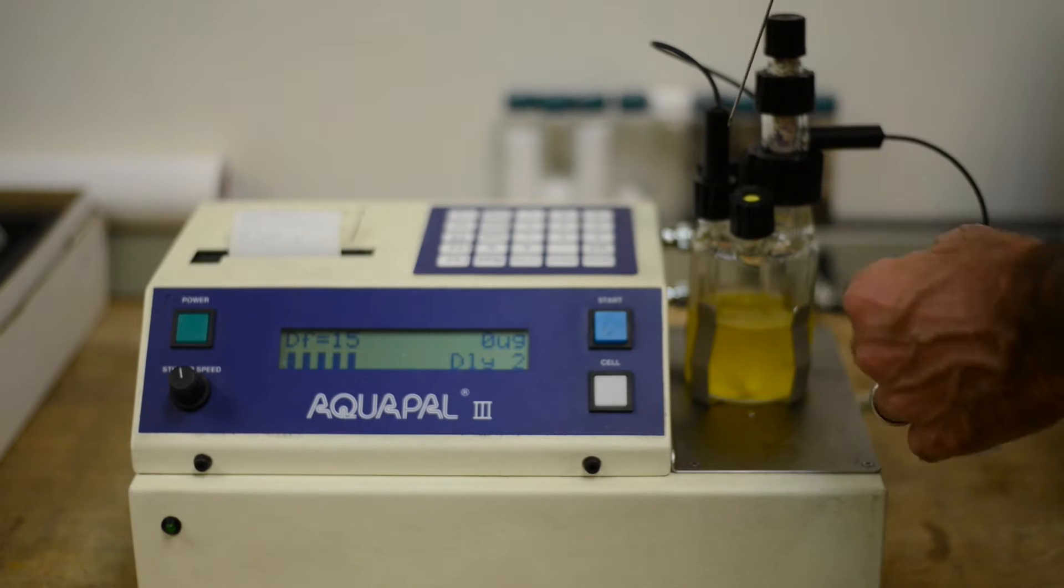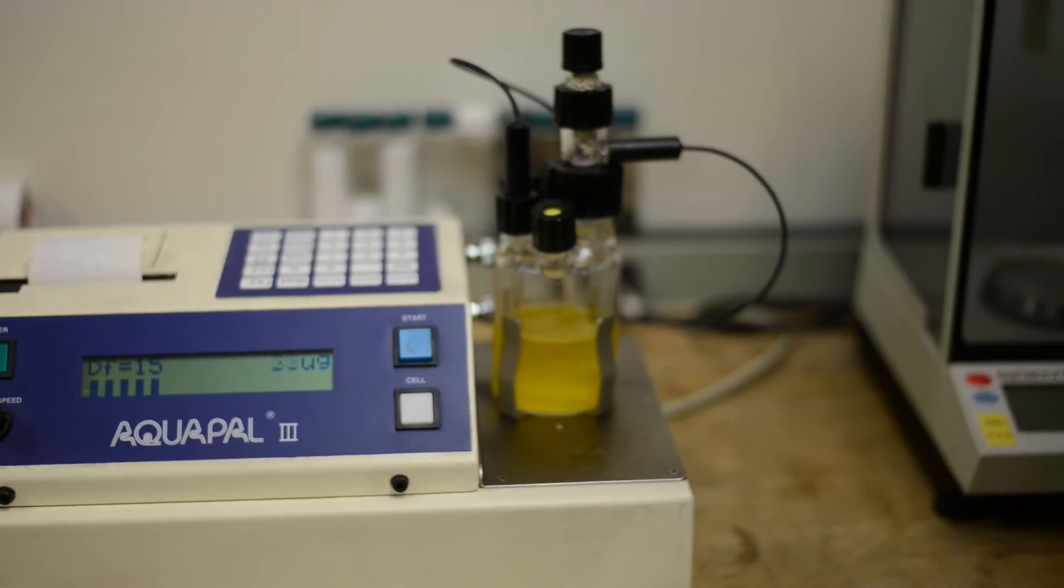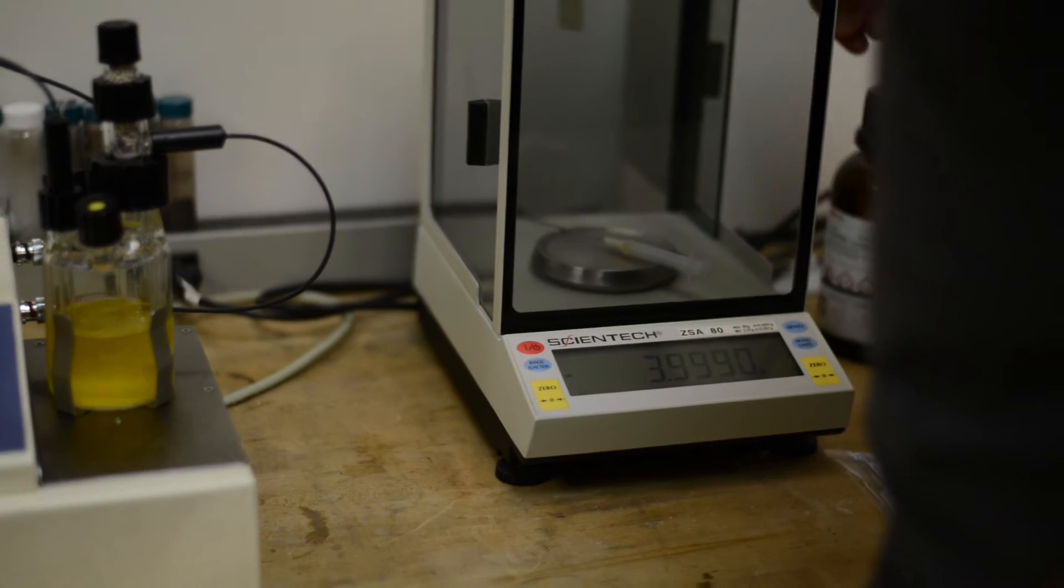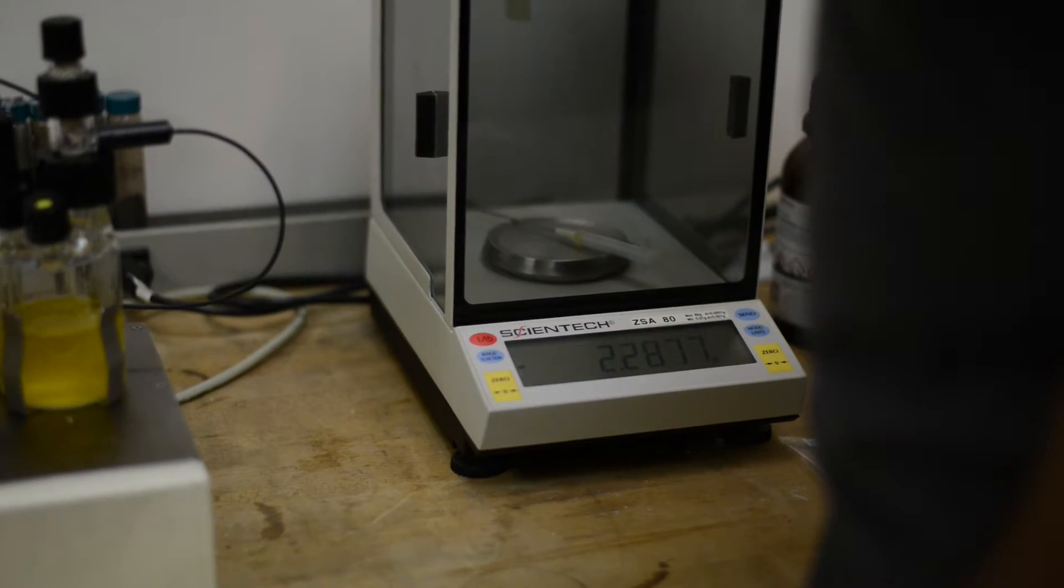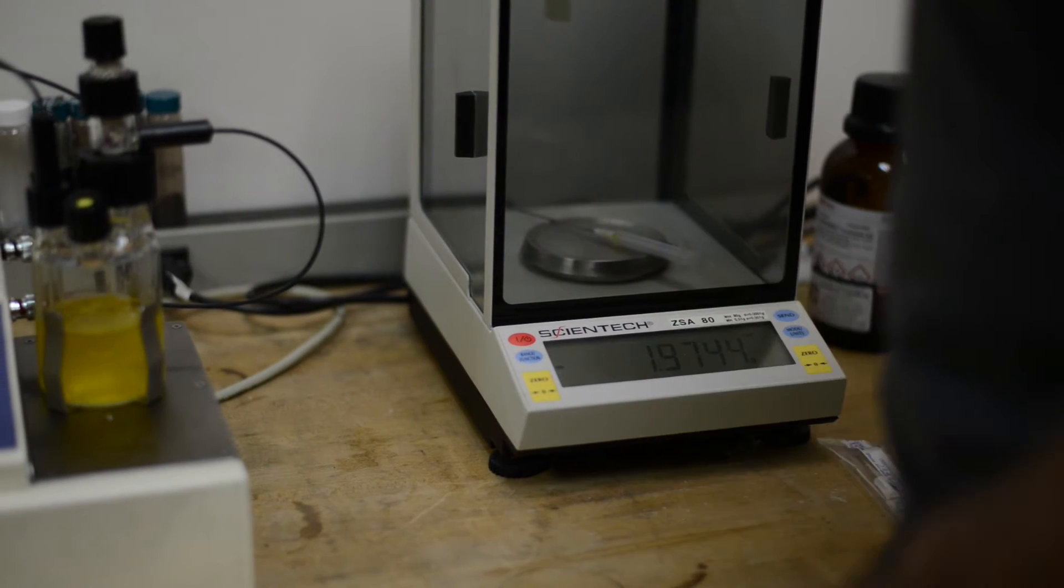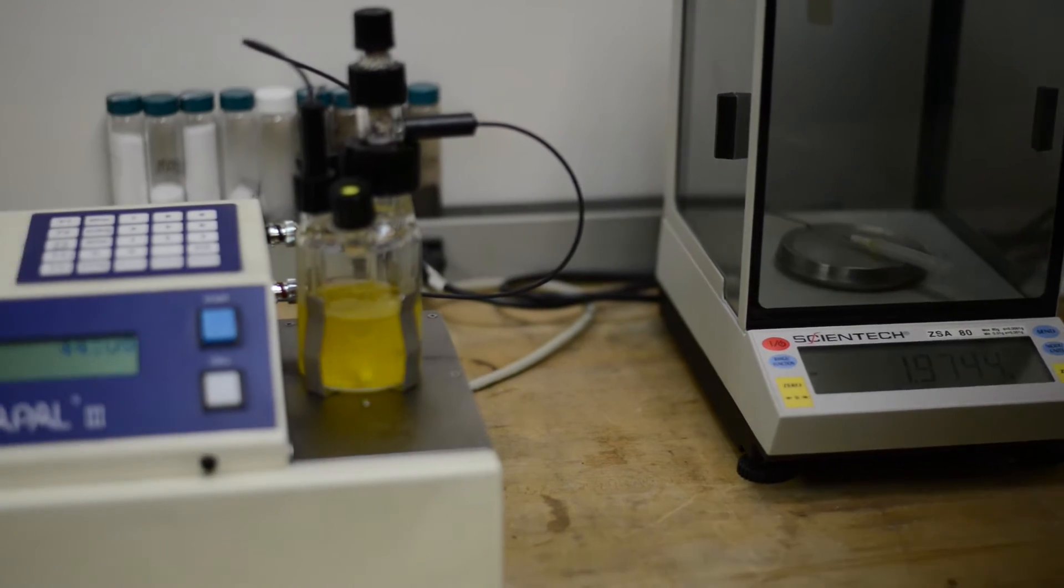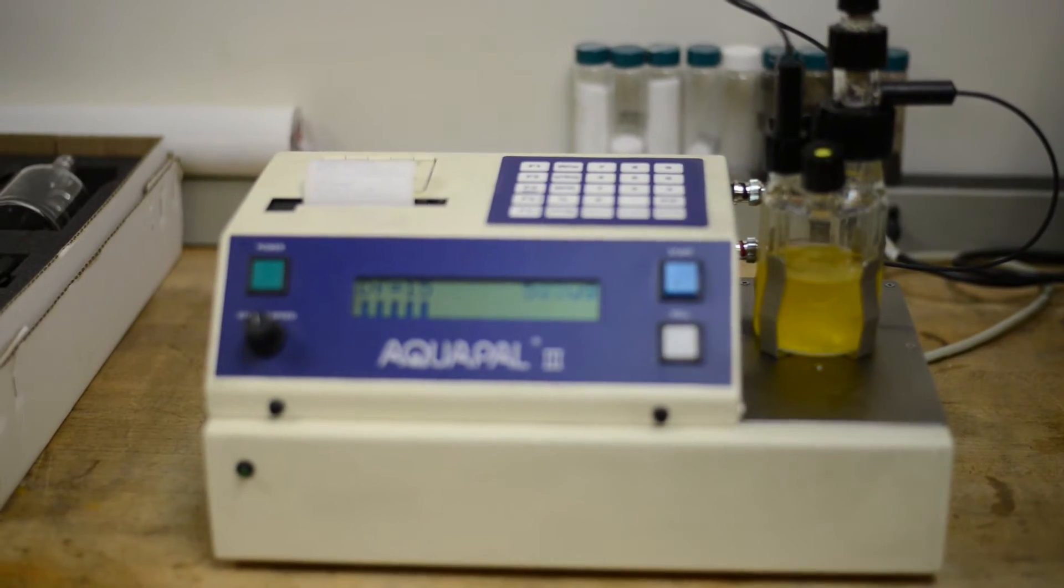Pull the syringe out. And re-weigh the syringe immediately. Because the weight that we're going to see here will be the weight of our sample. In this case, it's 1.9744 grams, which is close to 2 milliliters.